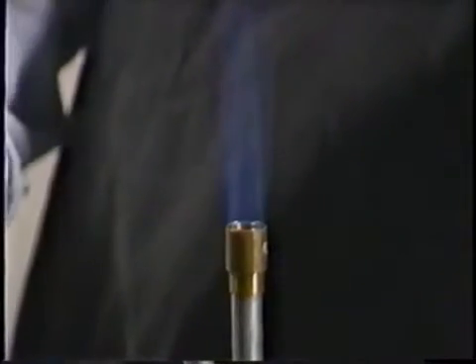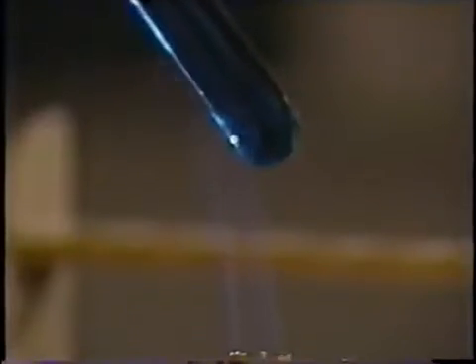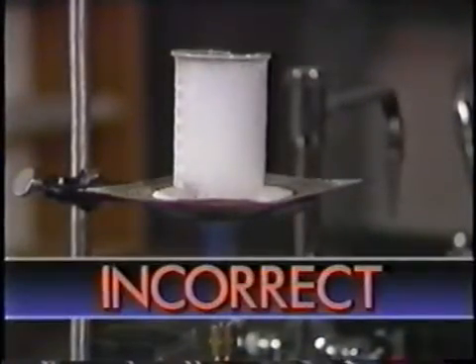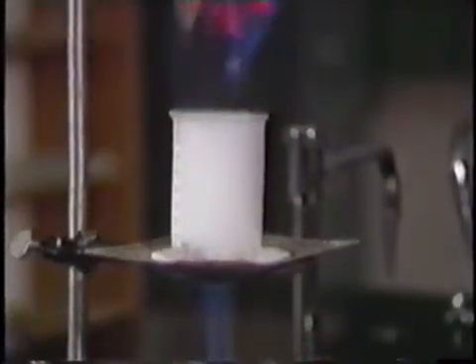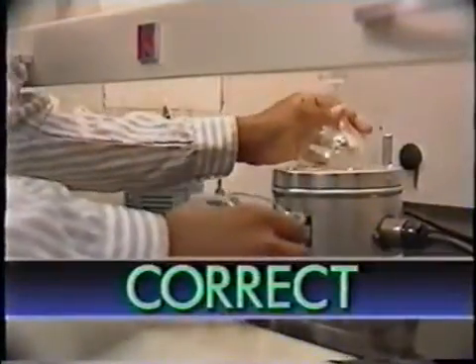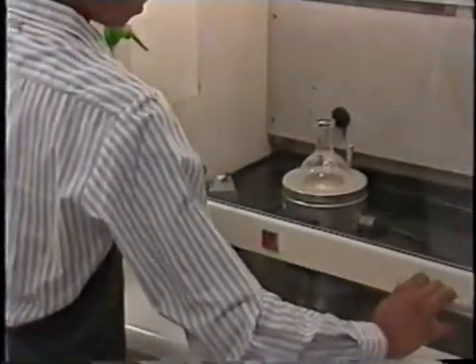The main heat source in most chemistry labs is the Bunsen burner. It produces an open gas flame burning at a high temperature. There's always the danger of an accident if it's not used properly. For example, it should never be used to heat volatile organic liquids that give off flammable vapors. These substances should be heated in a heating mantle or a steam bath in a hood. But for most other substances, a Bunsen burner is an ideal heat source when used properly.